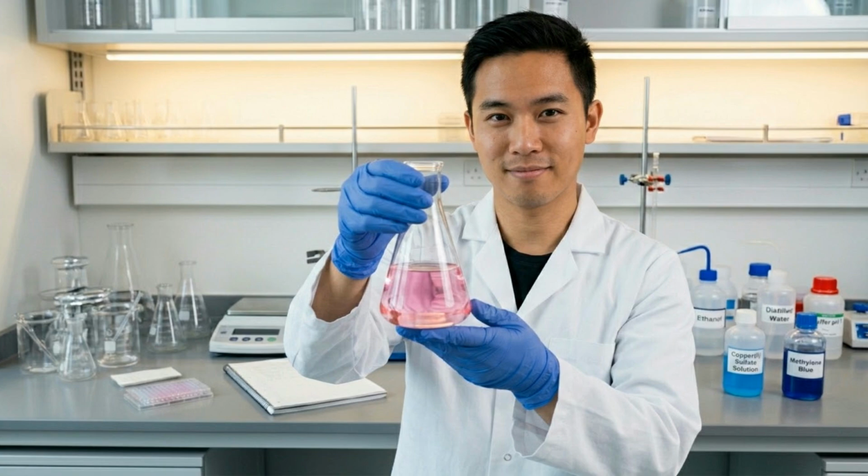This is a conical flask, and it is used for holding liquids, mixing solutions, or completing chemical reactions. It is also designed to make it easy to swirl or mix liquids.